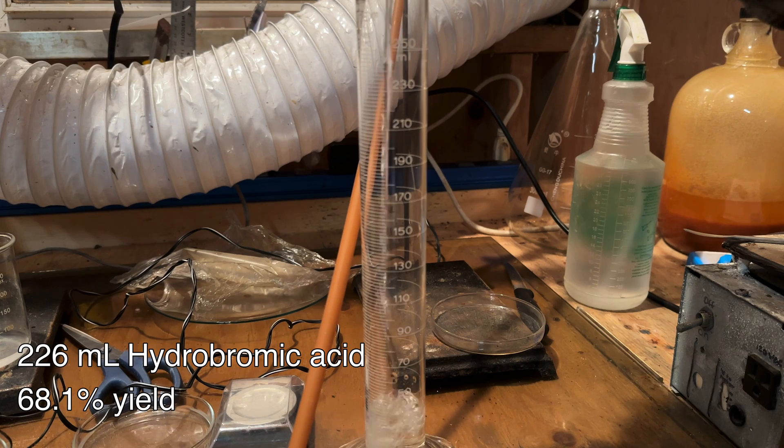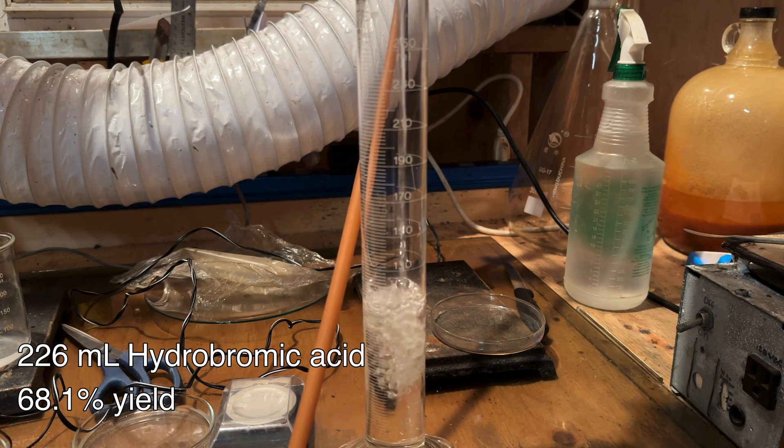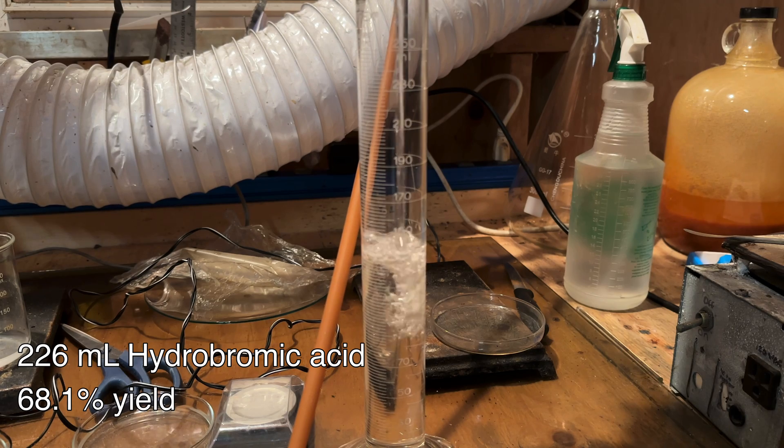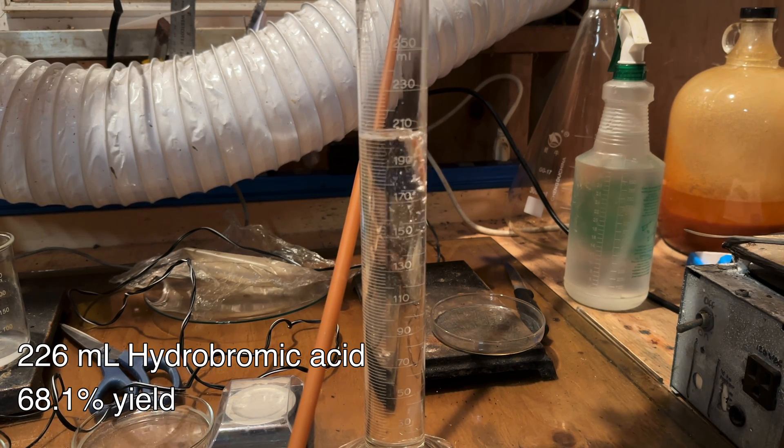In the end, 226 milliliters of concentrated azeotropic hydrobromic acid was collected, corresponding to a 68.1% yield based on the starting potassium bromide. This is surprisingly good considering it sat for so many years.